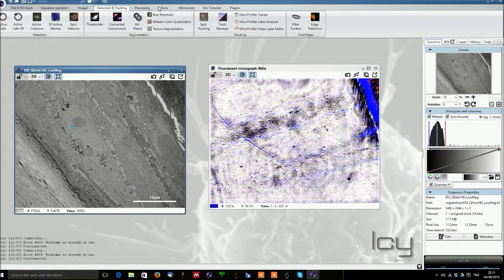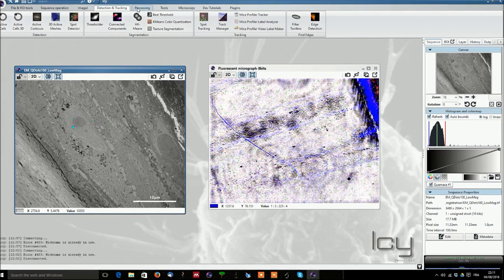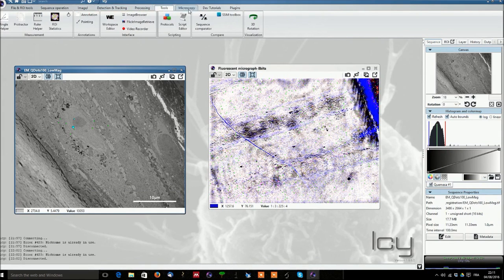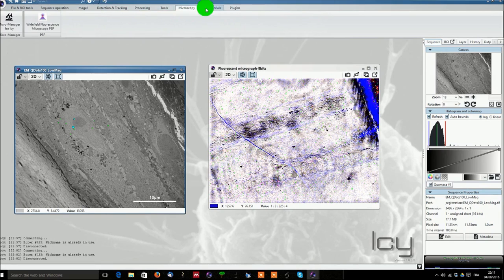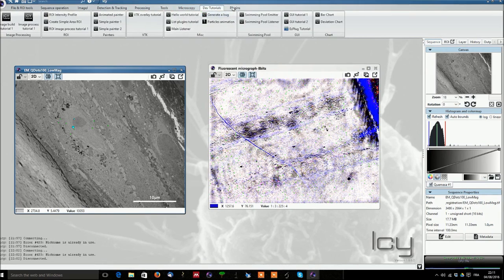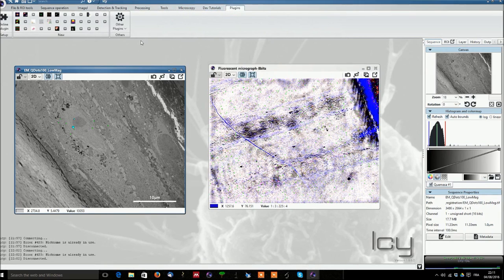You can also use different plugins which are under different sub names so detection and tracking, processing, tools, microscopy, developmental tutorials are for developers and then finally plugins if you have installed a plugin.